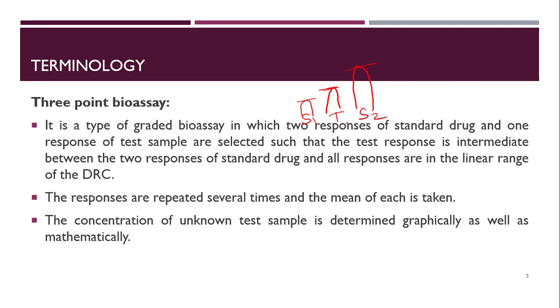Okay, so the responses are repeated several times and the mean of each is taken. So the concentration of the unknown test sample is determined graphically as well as mathematically.